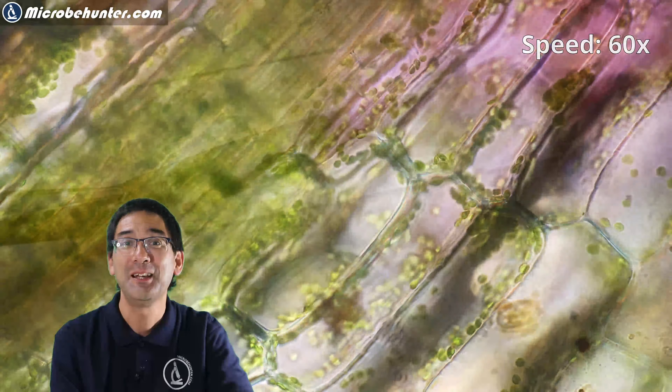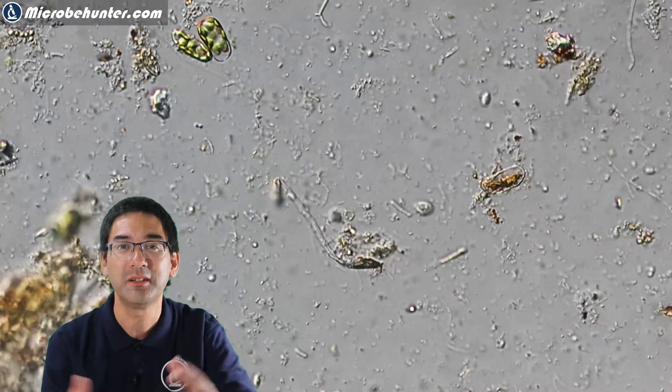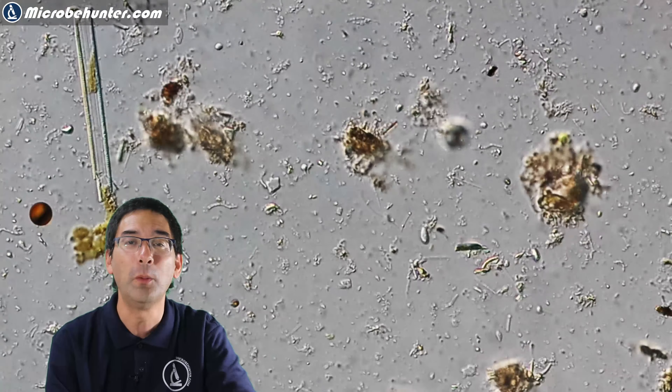Here with a different plant, I tried to scratch off the biofilm. This of course destroys the biofilm, but I still wanted to see more directly what was actually growing on the plant leaf. There was a lot of unrecognizable material, maybe debris as well, and of course many bacteria, but there were again the occasional diatoms, and I was quite happy to find one rotifer as well, which was moving around. So we see that those biofilms are very complex — I would say almost like an ecosystem — showing just how complex and diverse they really are.